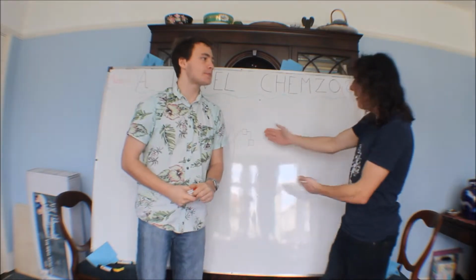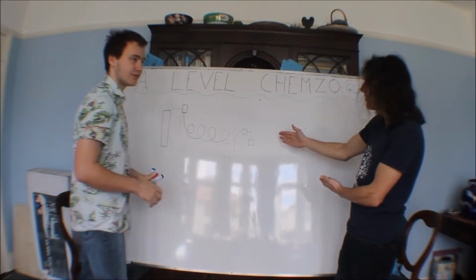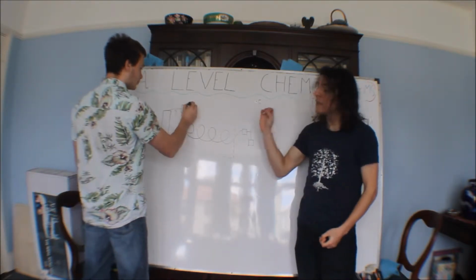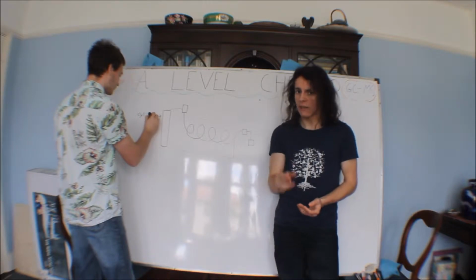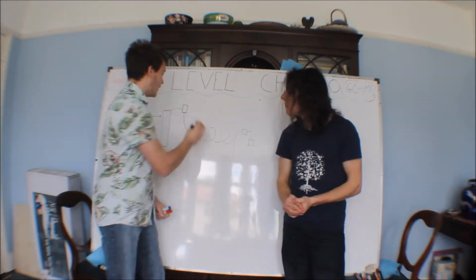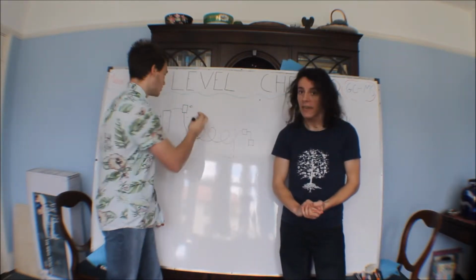We have here a lovely drawn chromatograph. So let's go through what all the things are. At the far left we have a cylinder. It contains our inert gas, our mobile phase, remembering that that is the thing that moves through our stationary phase. Here we have some sort of injector. This is where the subject we're testing goes in.